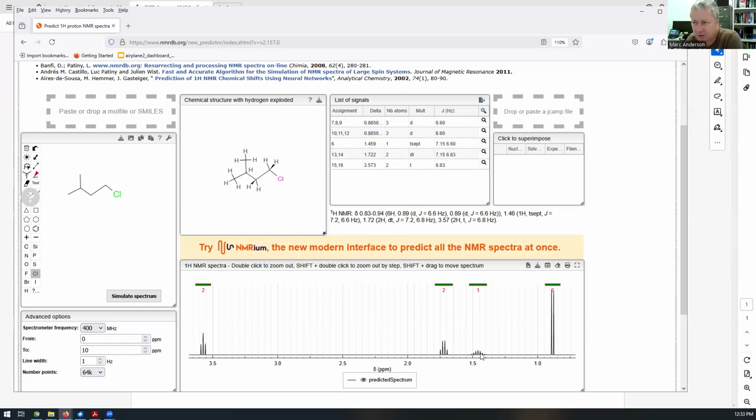A little hard to see, but there's 9. And sometimes you can't actually count all the lines perfectly, but we know there's a lot of neighbors there. Okay, and then we got the 2 CH3s that are overlapping, 6 hydrogens, and that's in the upfield region.